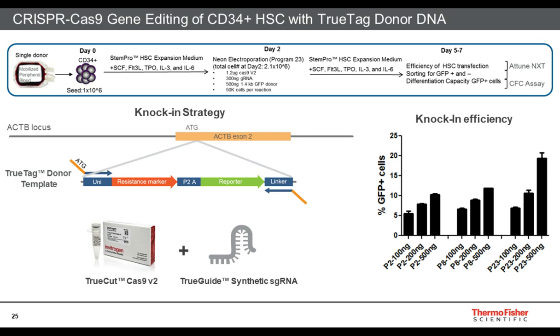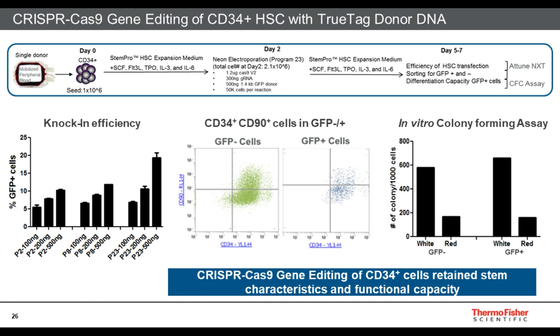And note we're also able to look at the different doses and get a really nice dose response of our editing experiment as measured by GFP positive cells. These were also analyzed to ensure that they were still CD34 positive and CD90 positive after adding the TrueTag.